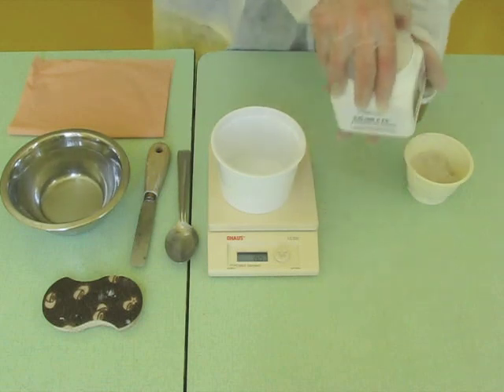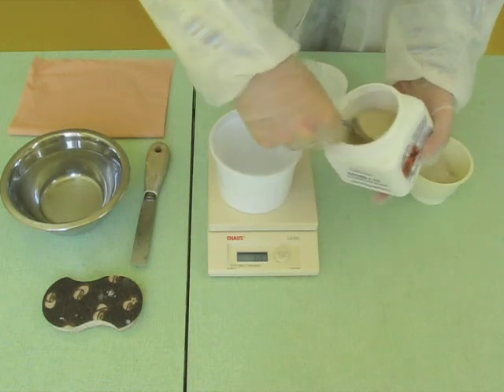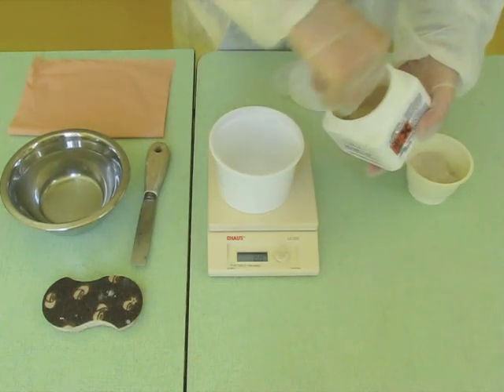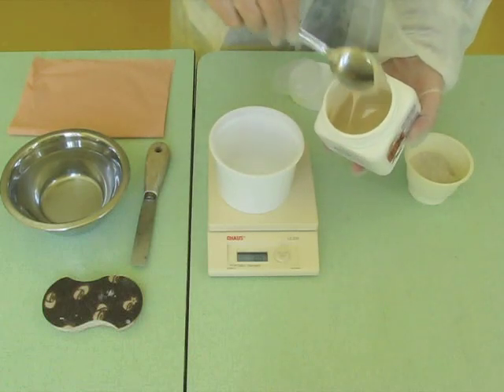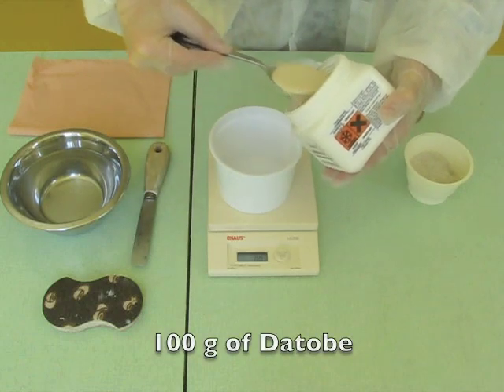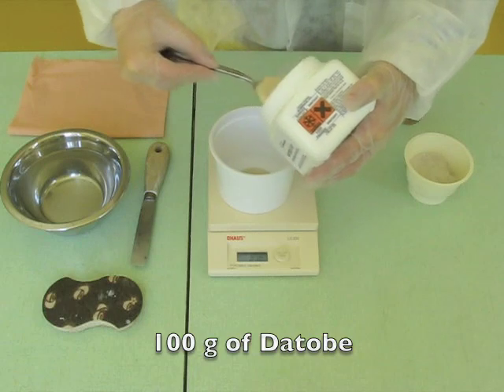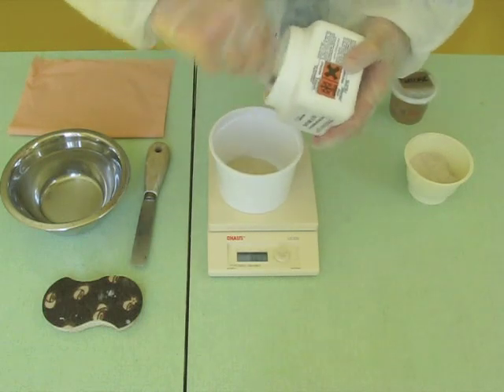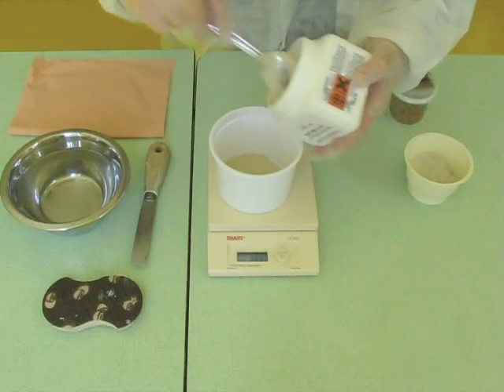Here are the directions for use of a Datobe ceramic for simple applications. Prepare one part by weight of Datobe binder and between 50% and 200% by weight of fillers depending on its granulometry. For this tutorial, we weigh 100 grams of binder. Note that the Datobe binder is still fluid after taking it out of the freezer — it can be used immediately.